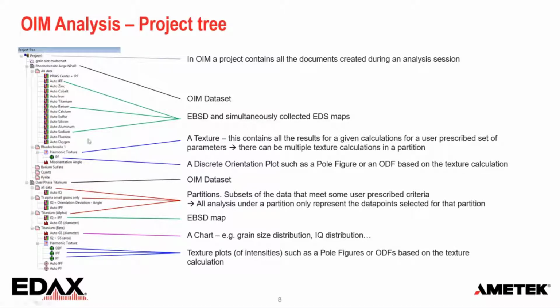And then inside a texture, you have the plots, ODF calculations, IPF, pole figure plots that belong to that particular calculation. So there's a lot of flexibility in here where you can really dedicate and tweak your analysis to your material.